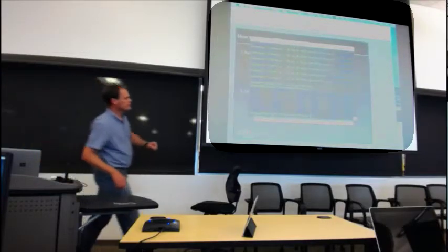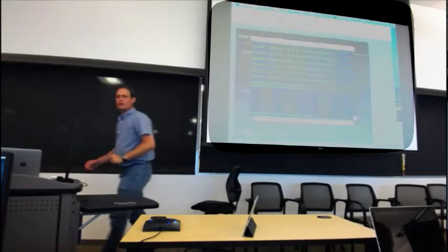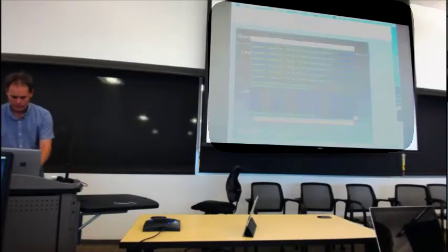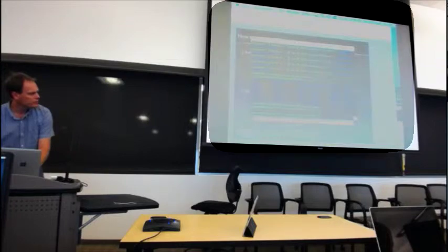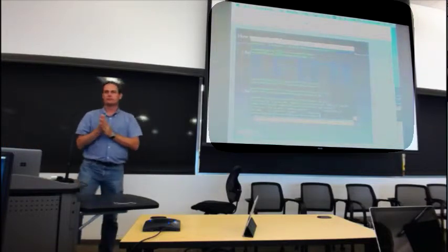That's the Scratch directory. These colors are really awful. If I go down into Anton there, you'll see there's a Cheetah directory, and that's where you've got the GUI file, and that's where you've got the process files that I was just talking about. That's what you should see down there.